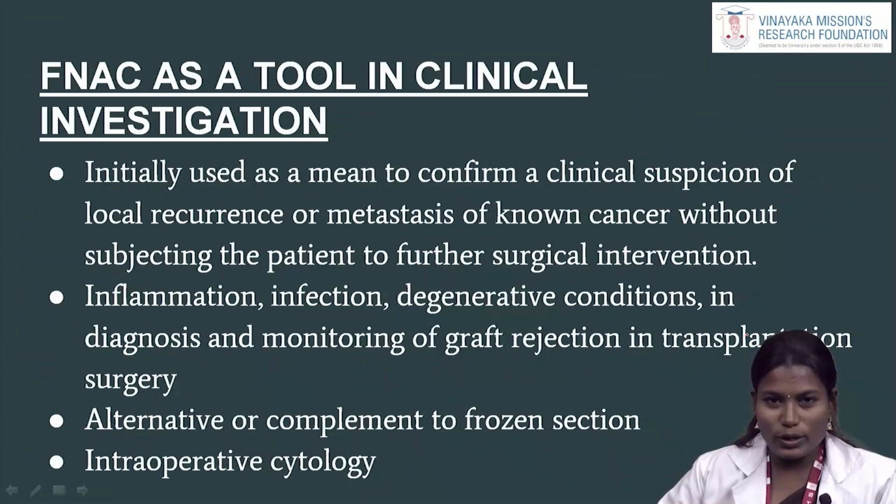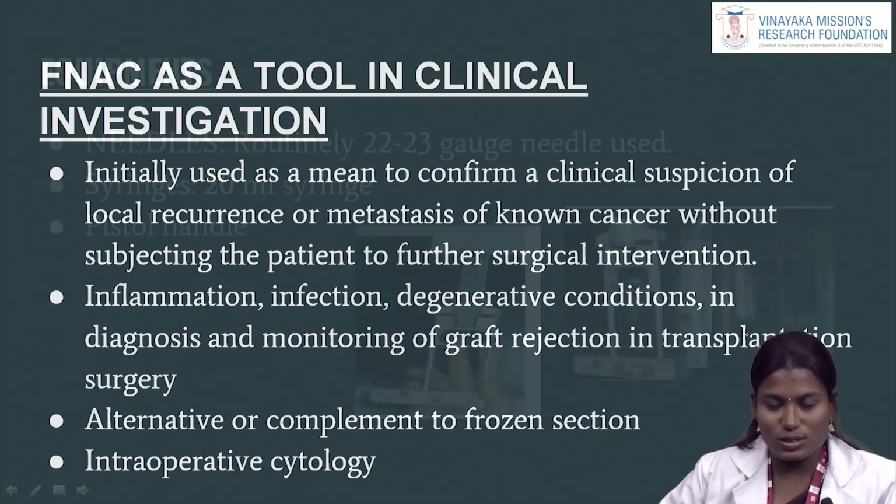The first important point is to investigate the sample collection area, where the lesion is located, and also transplantation, graft rejection or frozen sections, and other clinical situations like local recurrence and metastasis.